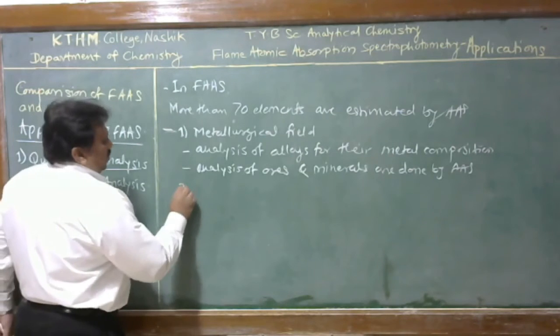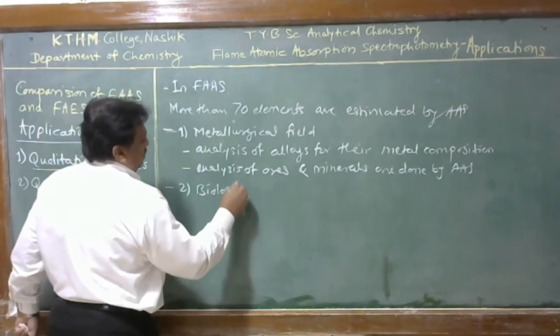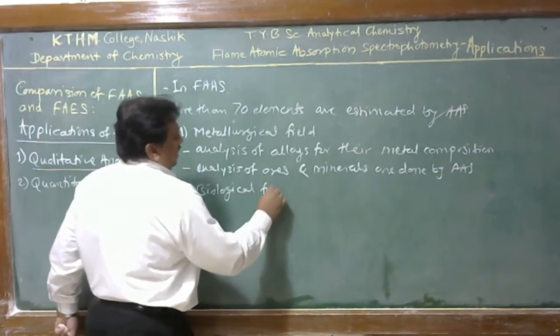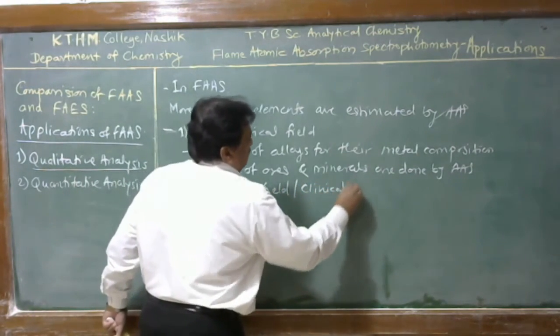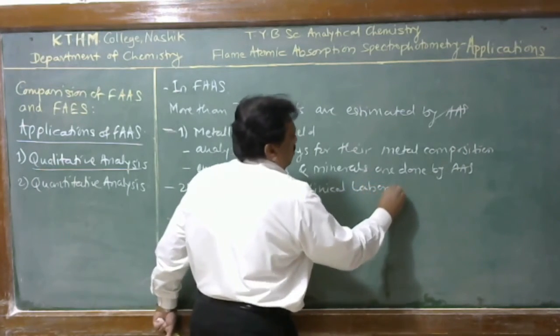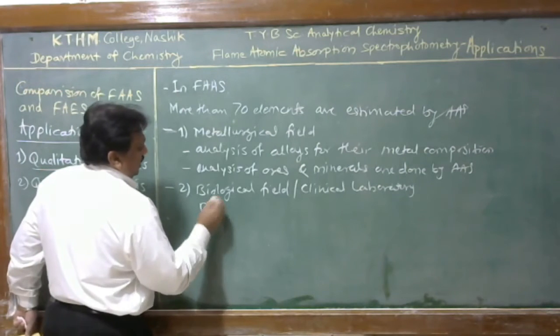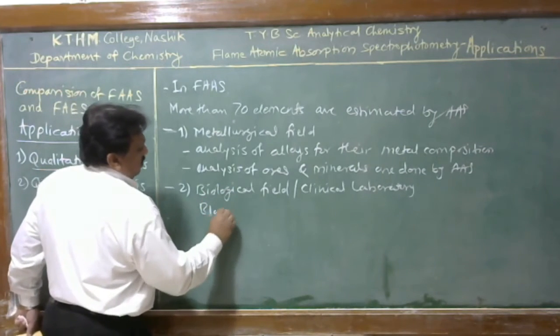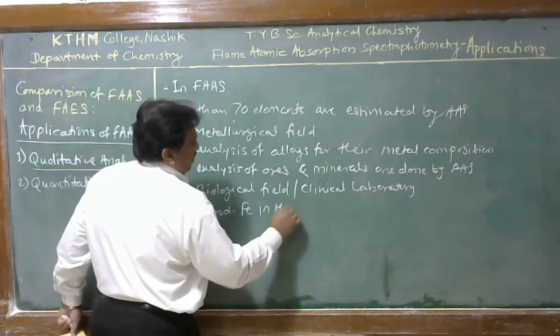In addition to this, it is useful in the biological field, that is, in a clinical laboratory, for analysis of blood, for determination of iron in hemoglobin.